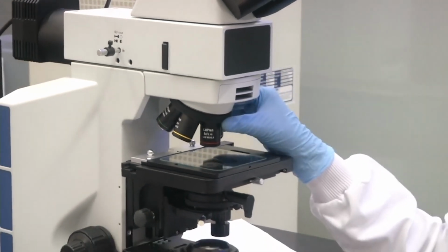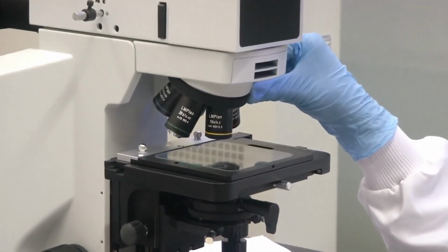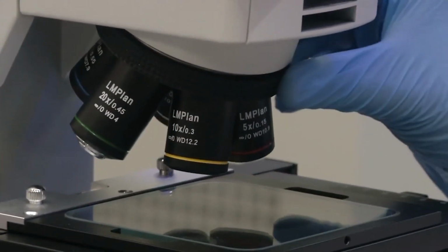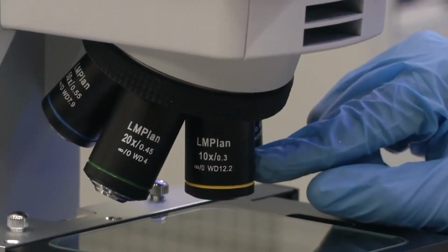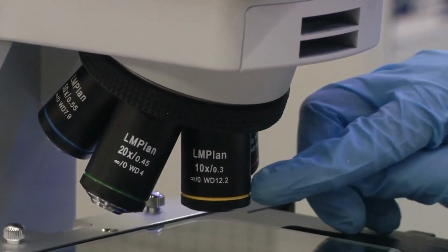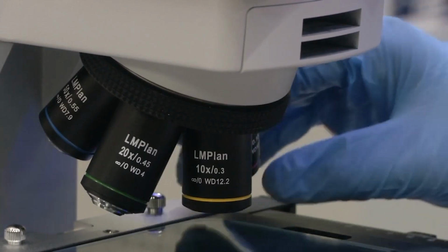Now suppose I adjust the turret. You can adjust the turret. As you see, the turret moves and gets locked on to the next objective that is there. Once it gets locked on, you can hear a click sound. I am not sure whether you can hear it, but there is a click sound and the next objective comes into position. Each objective is usually marked with a color, because as you use it over time, you will just look at the color and you will know that this is this magnification and this is another magnification.